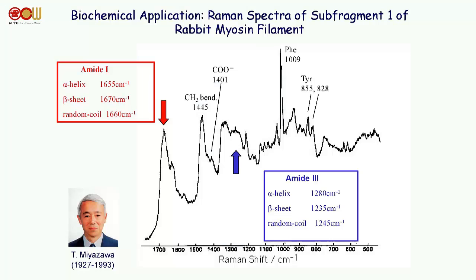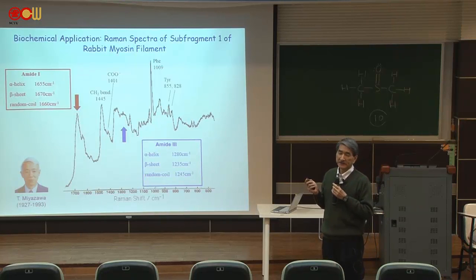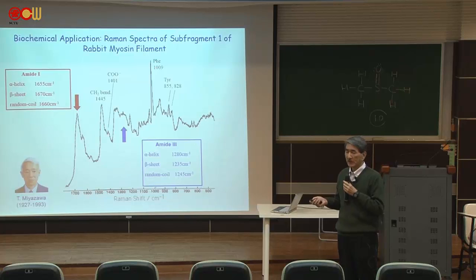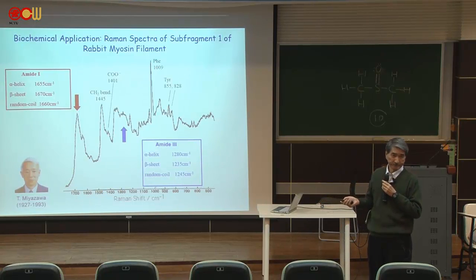And this is a structural chemistry application. And this is another biochemical application. Here I show this guy, Professor Miyazawa. He's my scientific uncle. And Miyazawa was one of the persons who analyzed the spectrum of proteins.